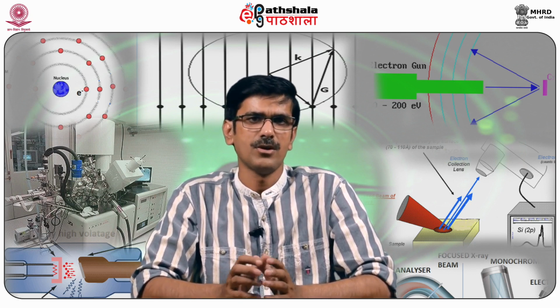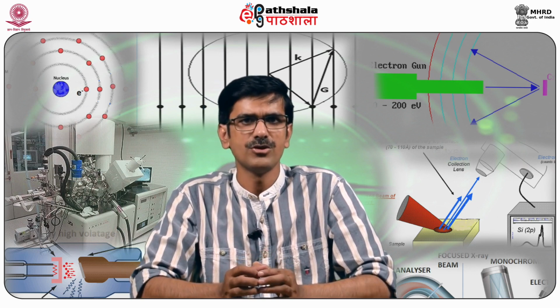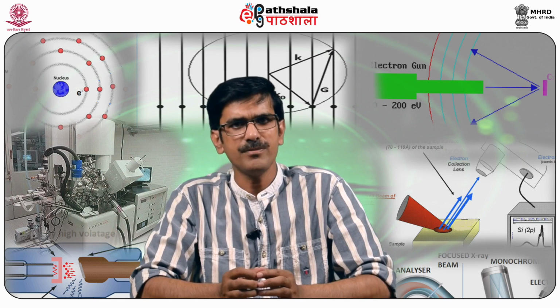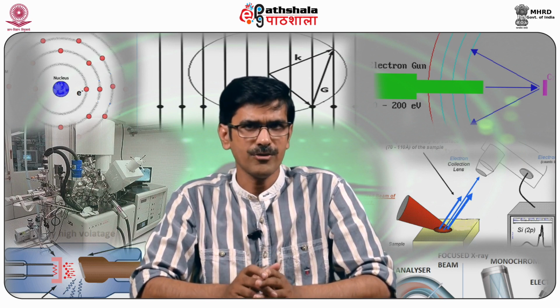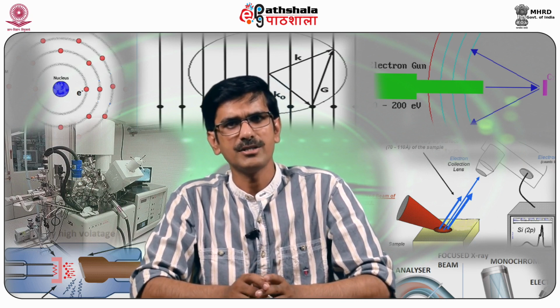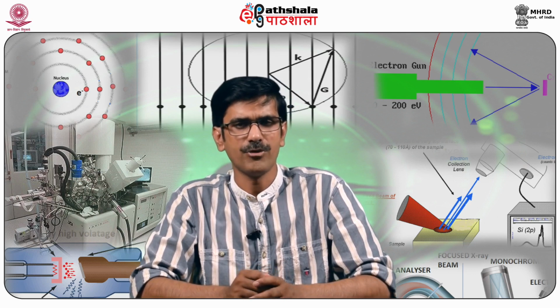These limits are the energy resolution, that is up to 130 electron volt, which is seen at full width at half maximum. The limit of detection is 1000 to 3000 ppm. The elements identified are elements having atomic number greater than 3. The spatial resolution for low atomic weight is 1 to 5 micrometer cube and for high it is 0.2 to 1 micrometer cube. The precision is approaching plus minus 0.1%.